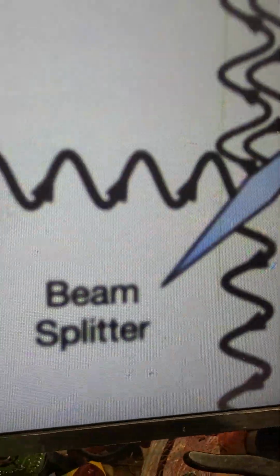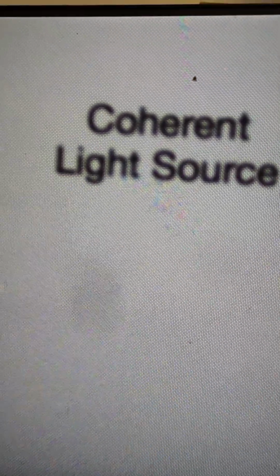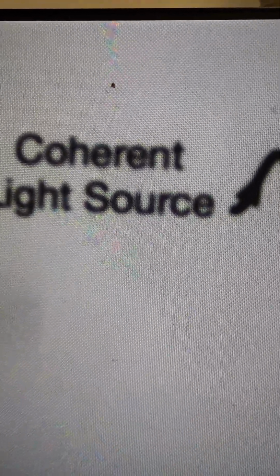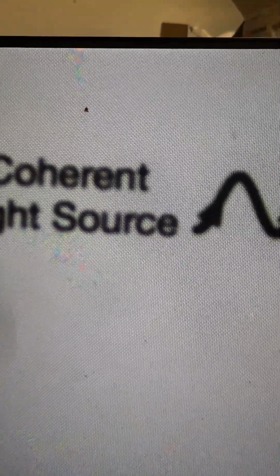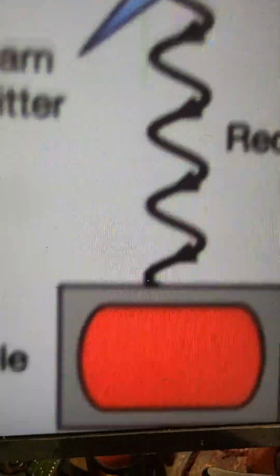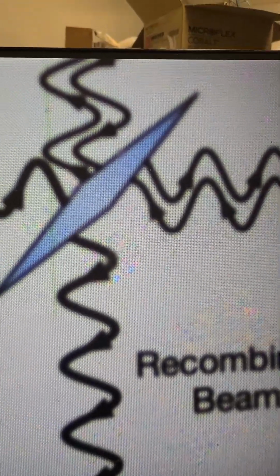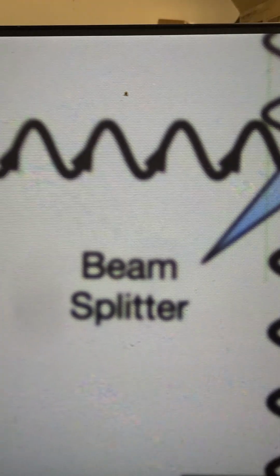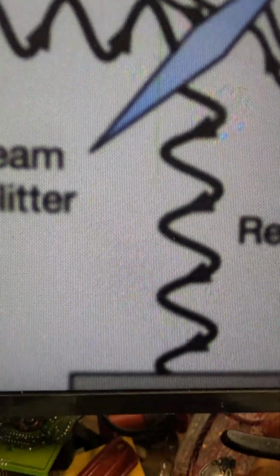Yeah, so black body radiation can be coherent as long as each individual spot on the emitted surface is kept together, so that when it recombines back through this mirror and semi-silvered mirror or glass surface, that one spot is recombined back together with that one spot.